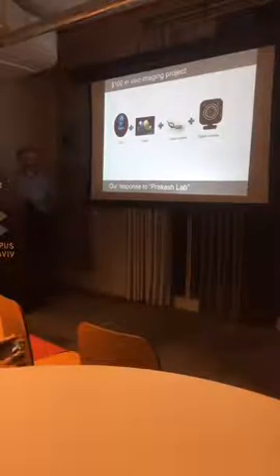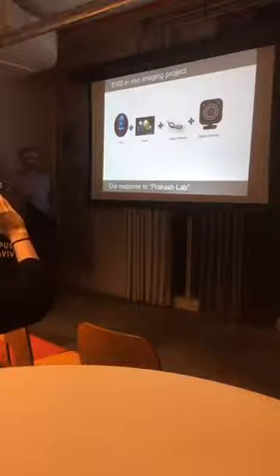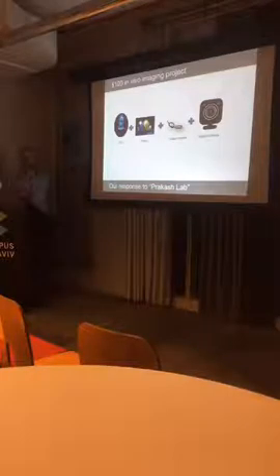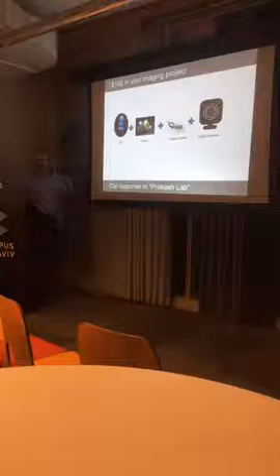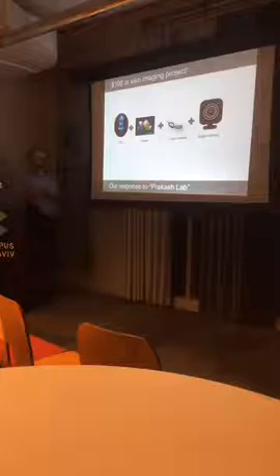I call it the $100 project, and I put 4 elements in it. Now I'll explain what the elements are. Actually, it is an LED, light emitting diode, as the first modality. Then, of course, we need the filters. This is the most expensive part, so we pay some attention, or maybe find a cheaper one.